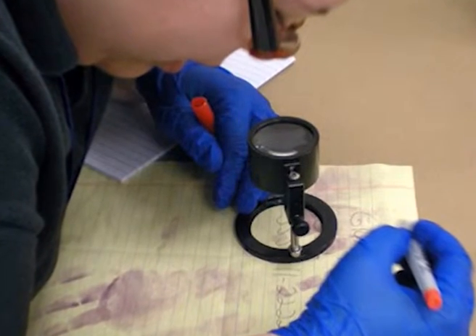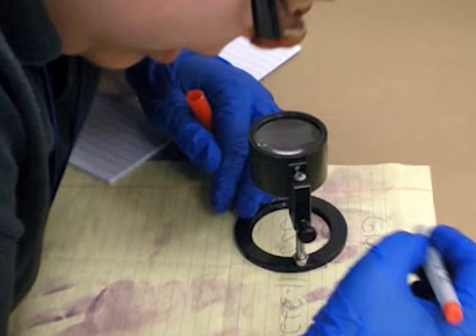Therefore, before the article under examination is dipped in the test solution, it is baked in an oven for appropriate time, depending on the reagent that is being used on that particular surface. As a result, the proteins get denatured and become fixed to the surface. Thereafter, the item is sprayed with the test solution of the reagent.